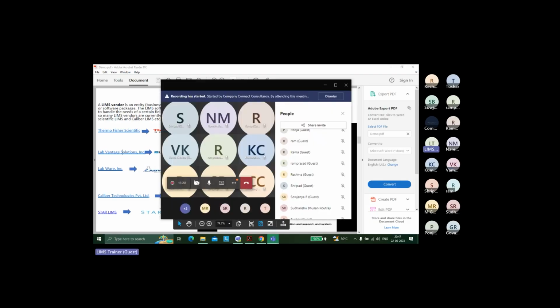Excuse me, what you are trying to say is that it requires .NET development side, you are talking, right? No, my point is that if you want to configure something in depth, something complicated, then you need to know a bit of development, for certain kinds of LIMS.